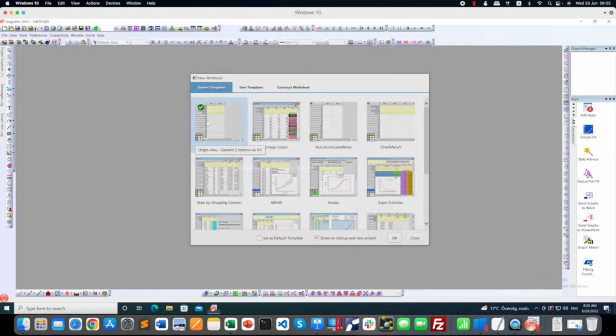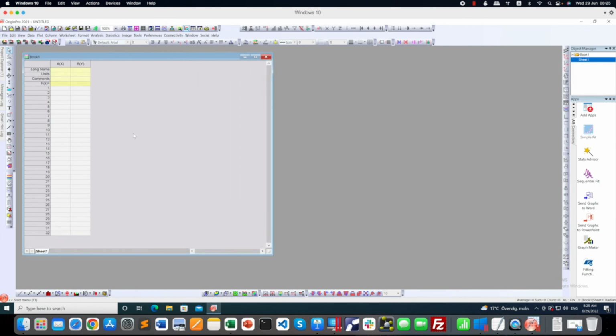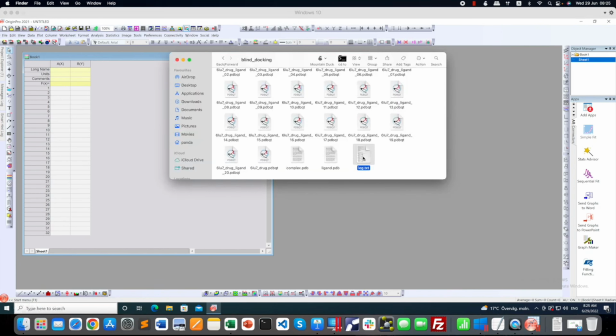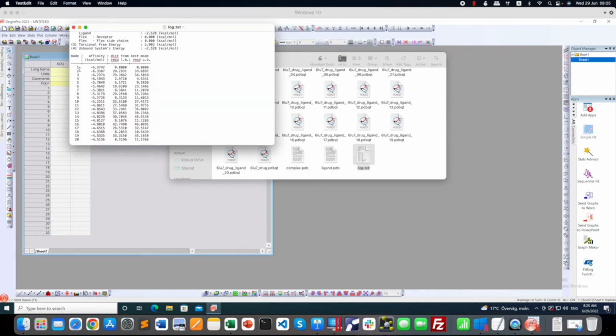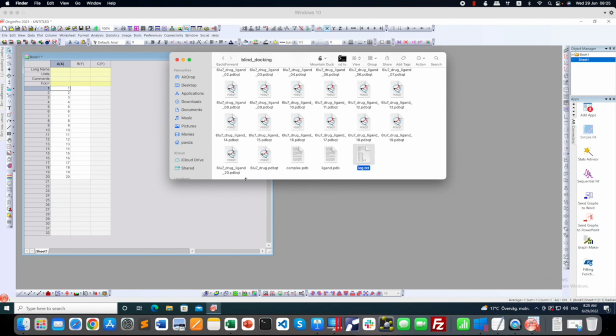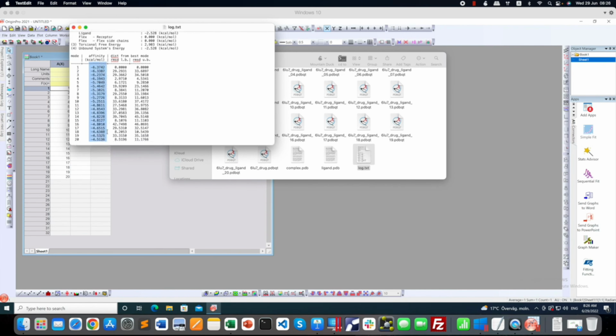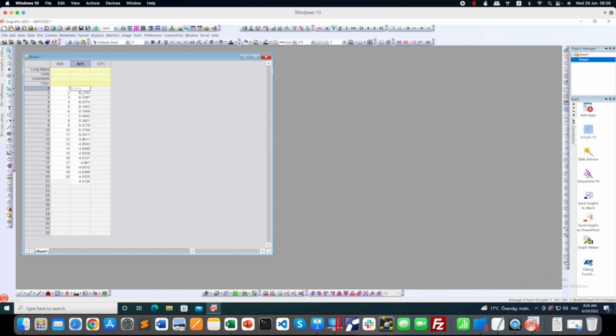By using Origin, and you might have known about different line plots or different column views. People generally use column view for receptor ligand interactions. So rather than that, I recommend everyone to go for box plots. So these are the defined modes. You just copy this and paste it over here, and I think the next thing that you want to do is copy the binding affinity values over here.